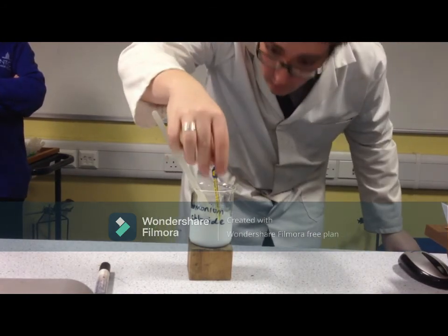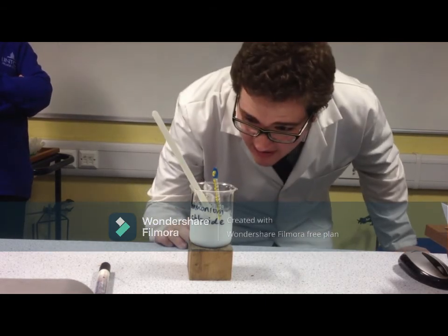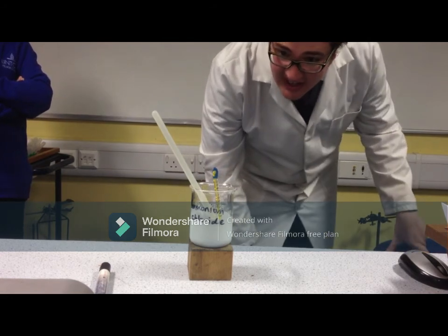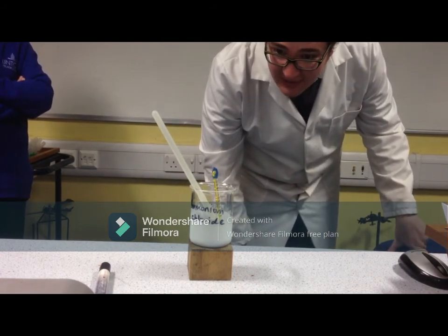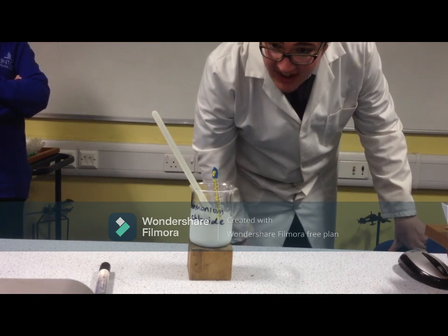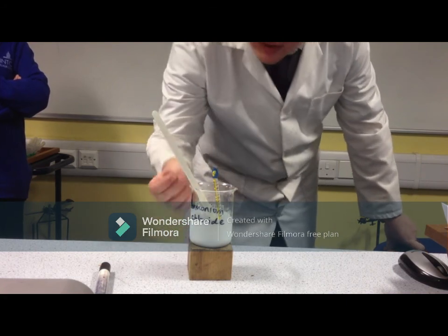And when he reads the temperature reading, it decreases. It's a reaction that absorbs heat from the surroundings. So some real-life applications of this include an ice pack or cold pack that is used to decrease a person's temperature when someone experiences fever.